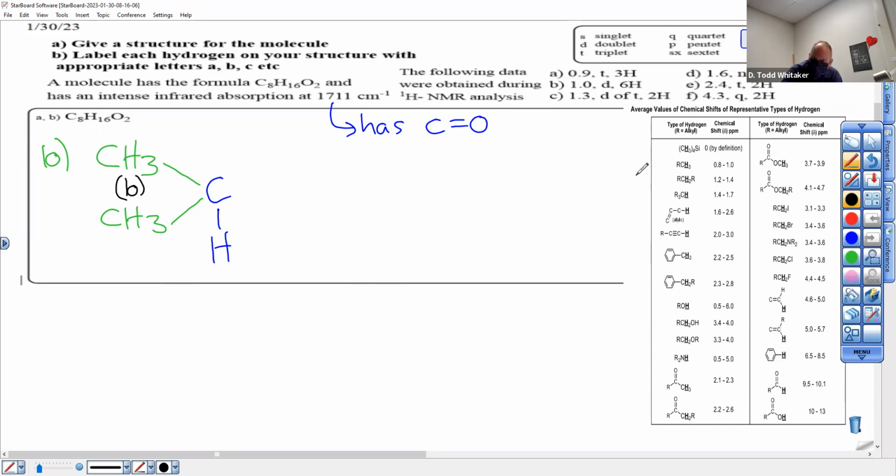We have to get up to 8. How do I know we have to get up to 8? Nonette. It's a CH2 next, isn't it? Oh man, I love when this stuff happens. CH2 in hot pink. And the nonette is letter D. So now we have 2 points for D. Pink is 3 possibilities, right? CH2 that it's pink, because we have 2 H's 3 times. So I'm not going to jump to any conclusions on that yet.